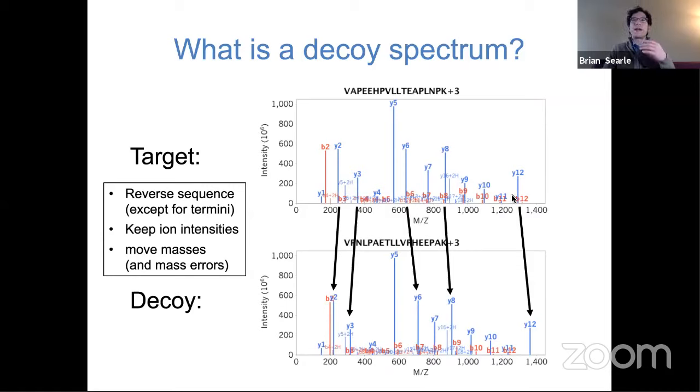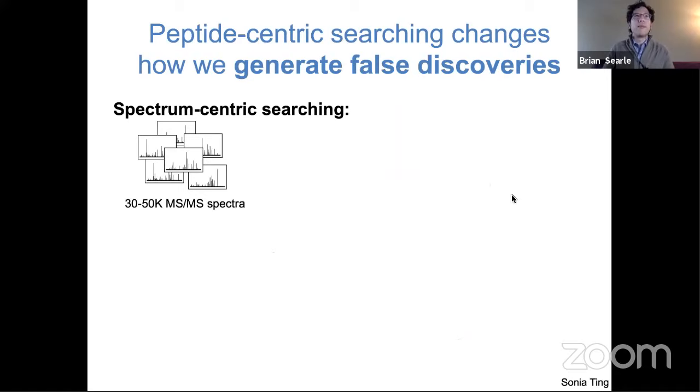It is not necessarily the best decoy, because we do know that this scrambled peptide sequence would actually fragment slightly differently than we've laid it out here. So there may be potential biases in terms of how we think of target decoy, but this is a reasonable approach, I think, given those sort of constraints.